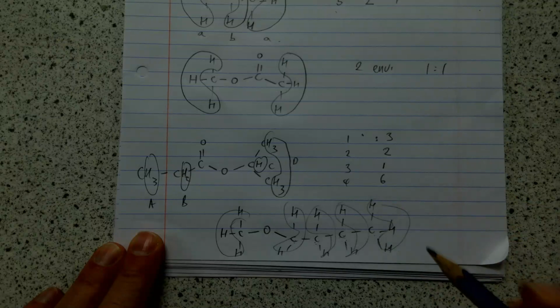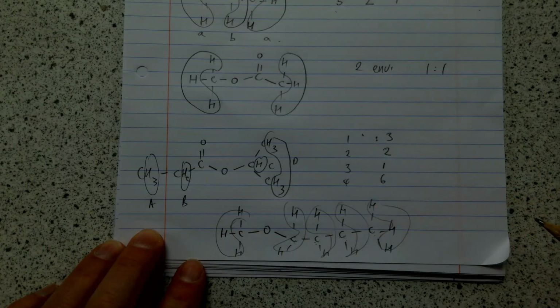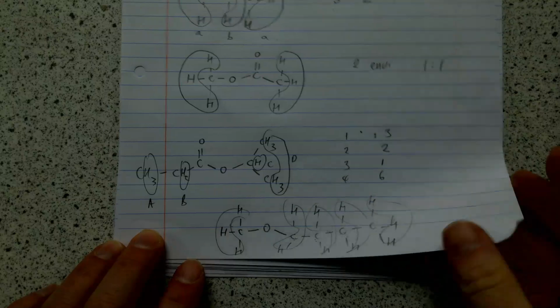And when you look at the slide, you realise there's a load of examples of this with the answers all given. A, B, C, D, E. 3 to 2 to 2 to 2 to 3 ratio. Happy with that idea? So let's then look at, find a spectrum. We'll look what a spectrum looks like, if I can find one. So here's an example of a spectrum in the work pack.